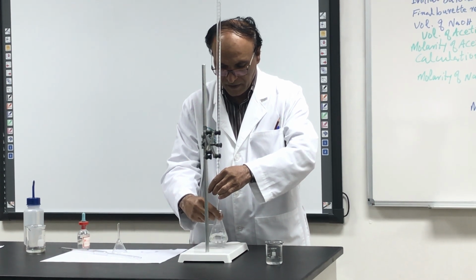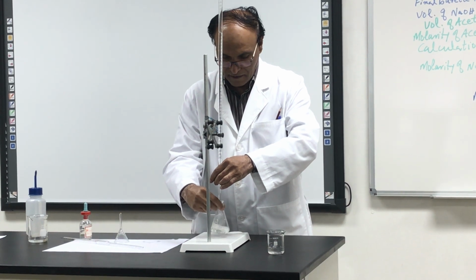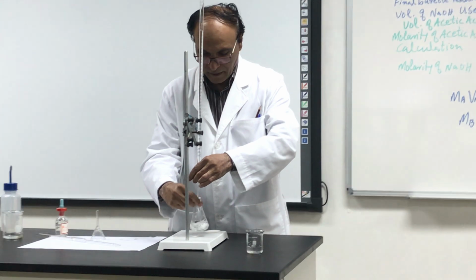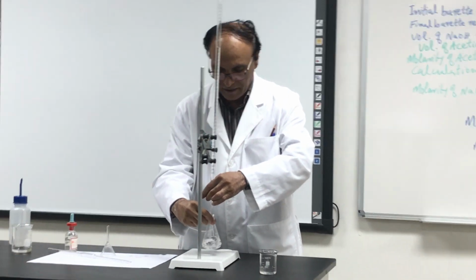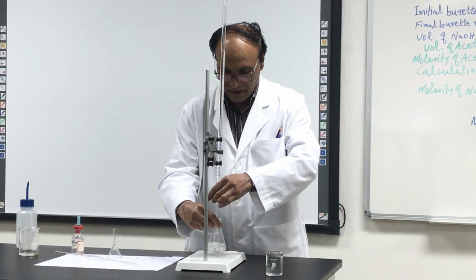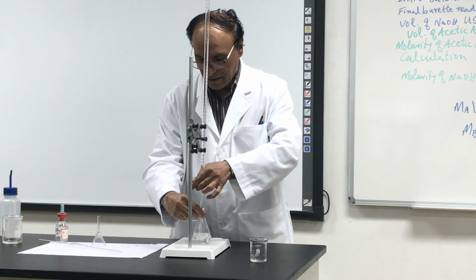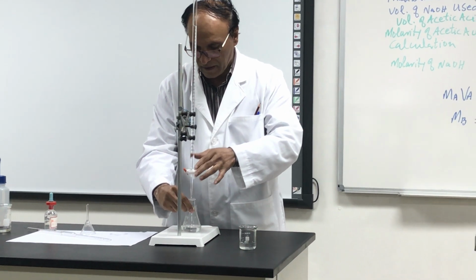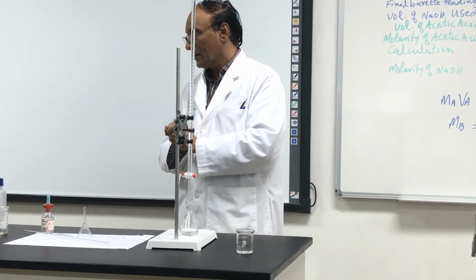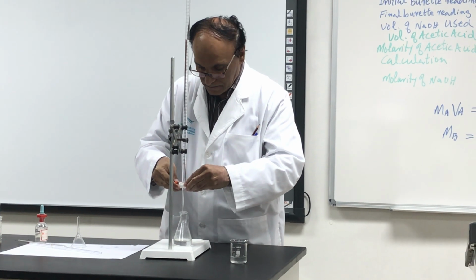Well, did you see this one? No. Okay, so you can see that the end point is disappearing late. You can see this one. It means the end point will be somewhere very close, in my opinion. Maybe it will take 2-3 drops more. So I have to be very careful in that.